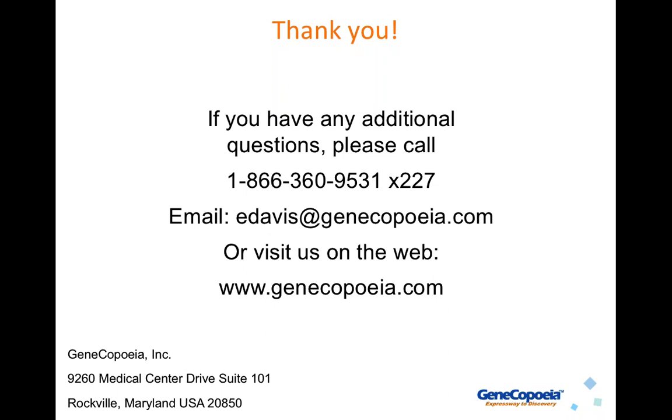Okay, next question. What is the benefit of using a donor clone for mutation instead of simply knocking out the gene using CRISPR and then making a stable cell line with another vector that contains the mutated gene sequence? Well, that's a good question. You can get knockouts using just NHEJ.